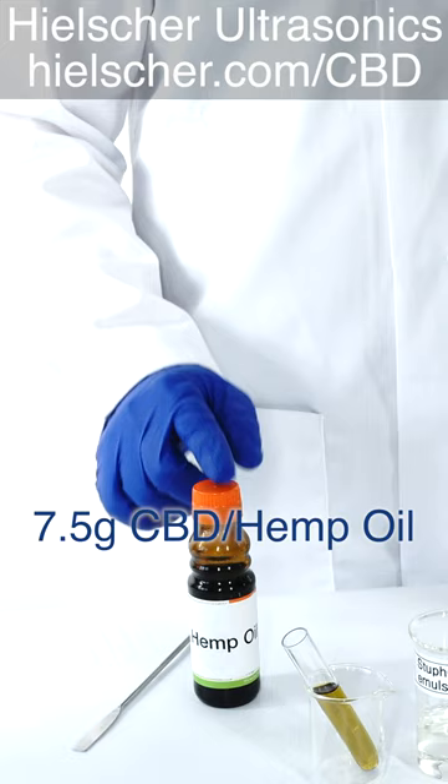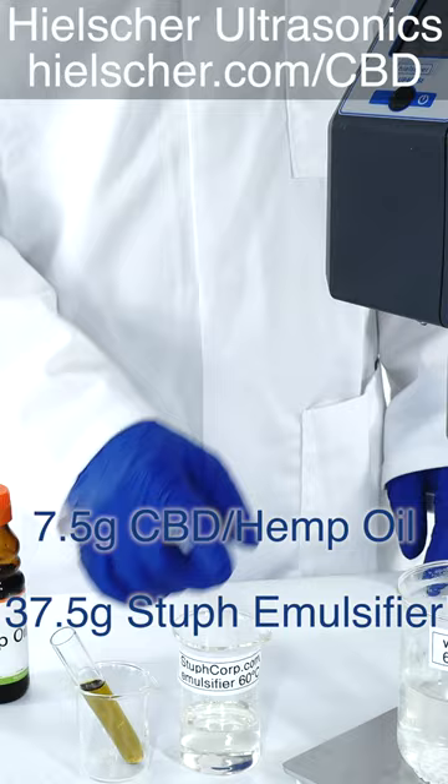We prepare 7.5 grams of CBD hemp oil, 37.5 grams of StuphCorp emulsifier, and 205 grams of water.